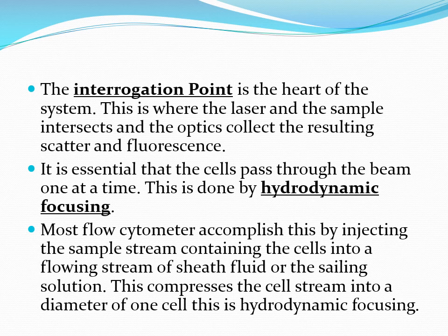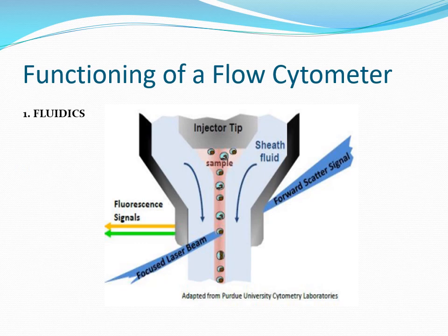Now it is essential that the cells pass through this laser beam, that is through this interrogation point, one at a time. This is achieved by hydrodynamic focusing. What we mean by hydrodynamic focusing is that we use the sheath fluid to channelize these cells.